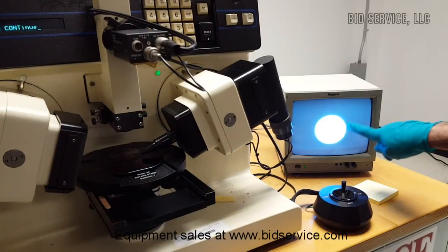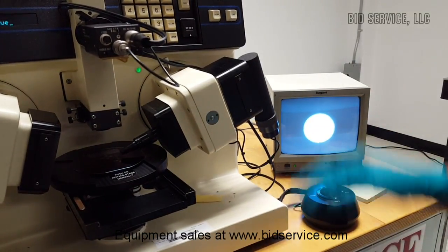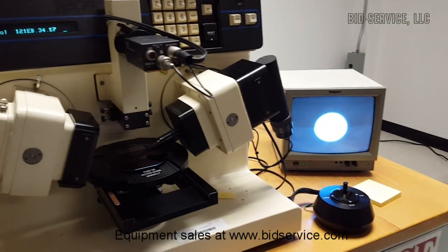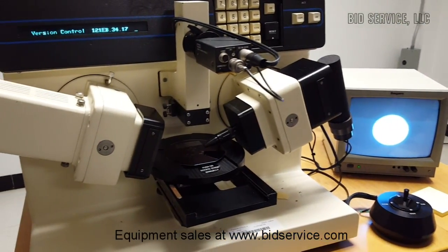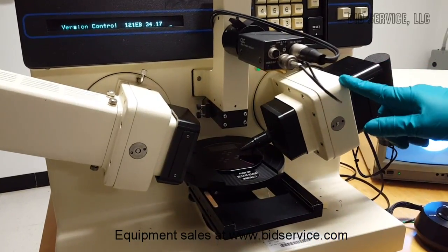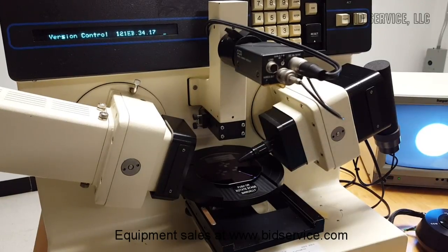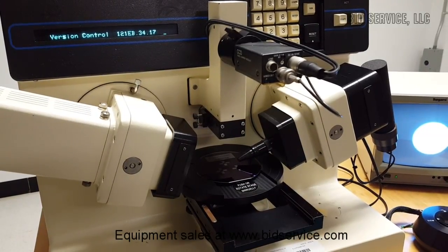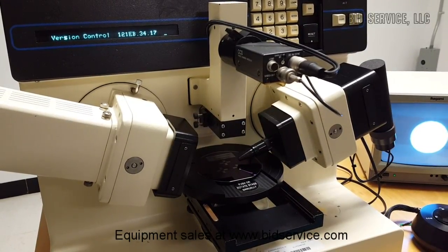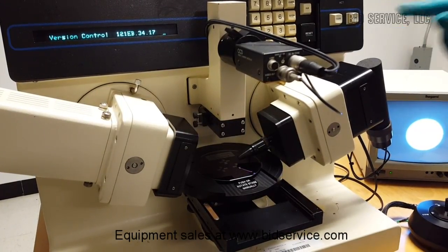There is a circle slightly visible here, and once you center it, press continue. So the system will start running the polarizer motor and the analyzer motor on the detector side, polarizer motor on the source side, and will prompt to operate the appropriate keys over time.